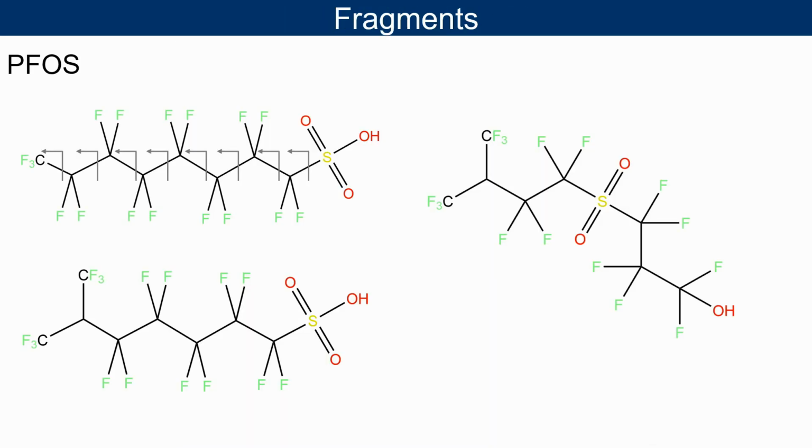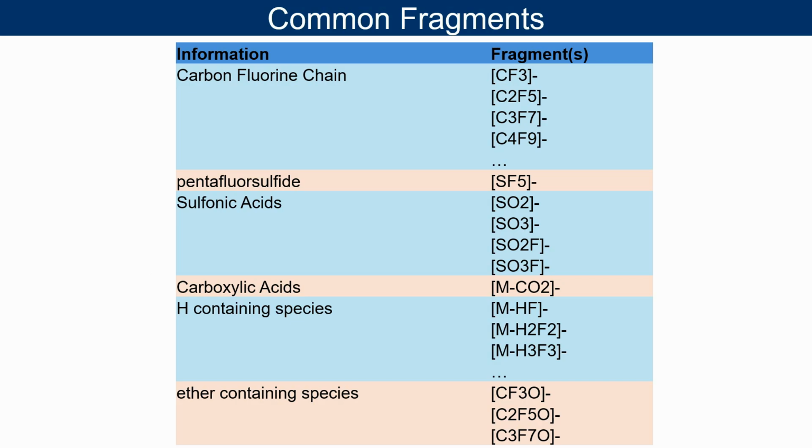You can see it's just breaking apart one part of the chain in another. And because we don't have one molecule, remember in mass spectrometry, we're actually measuring an innumerable amount of molecules, even at part per million or part per billion, part per trillion, there's still an innumerable amount of these molecules. So we're measuring a probability distribution of all those fragments occurring.